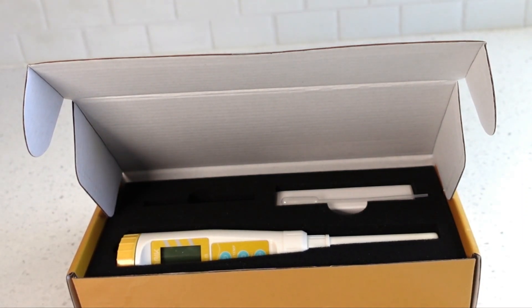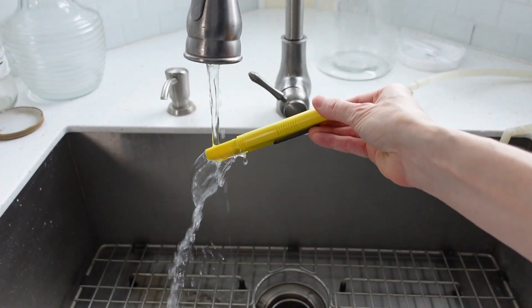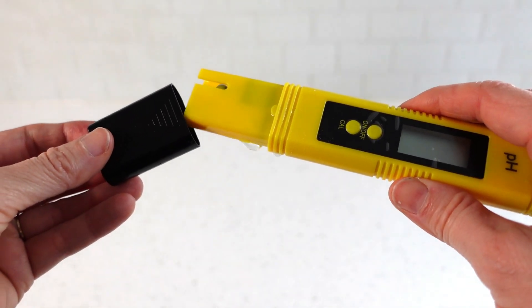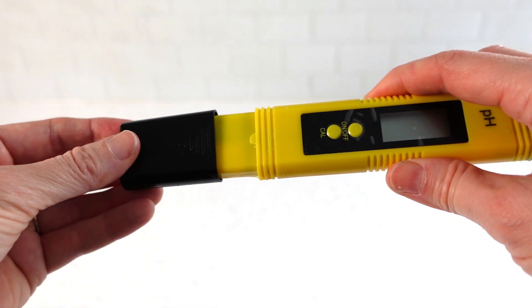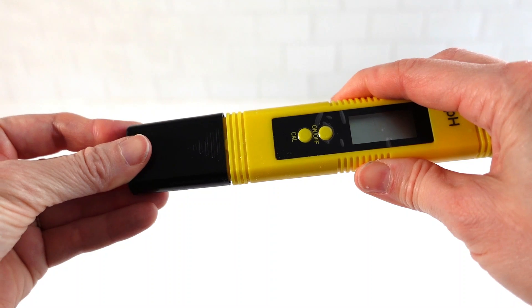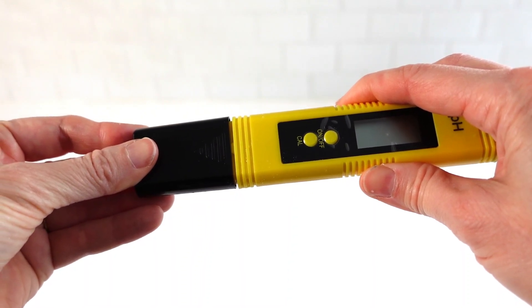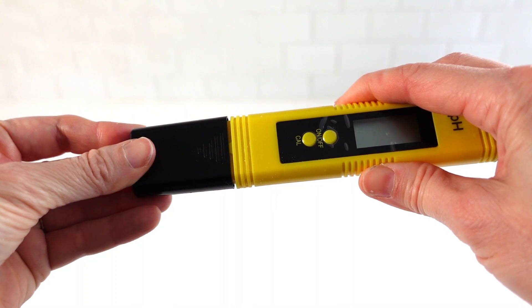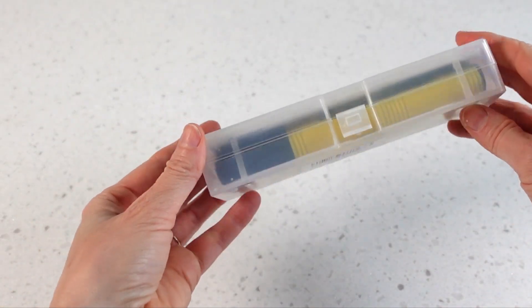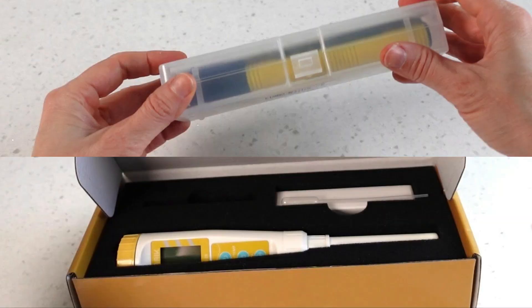If the probe is left for months without re-wetting, it will dry up and no longer work, so keeping it moist is important for longevity. The basic meter probe also needs to remain moist — rinse with water then put the cap on while still wet, since the basic meter does not come with a sponge inside the cap. If used at least once a week it should be fine, but if it's going to be an extended period, set a reminder on your phone to re-wet the probe in a couple of weeks. The basic meter has a more minimal storage case than the upgrade meter, which is a nice and convenient feature.